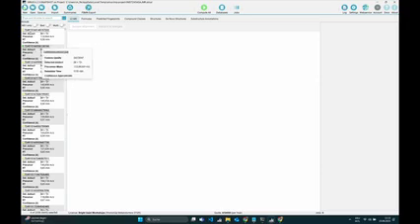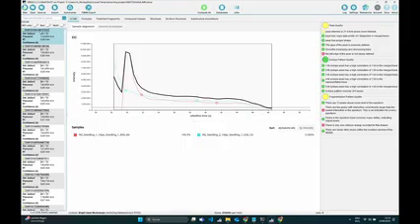And in the top line, you have this feature ID, this number that you see. And to the left of it is this small circle. And the circle already indicates feature quality. So what you can see now in this first tab, in the LCMS tab, is a tab which will give you some overview of your data over the chromatogram, and will also give you some indications on whether everything looks fine in your data. There's like a simple traffic light system, so if this feature has now like a yellow circle, it will mean, okay, this is a decent feature, it's not perfect, maybe some stuff is missing. Maybe here it is telling us that there might be something in the fragmentation pattern quality that isn't perfect, but this is at least a decent feature.